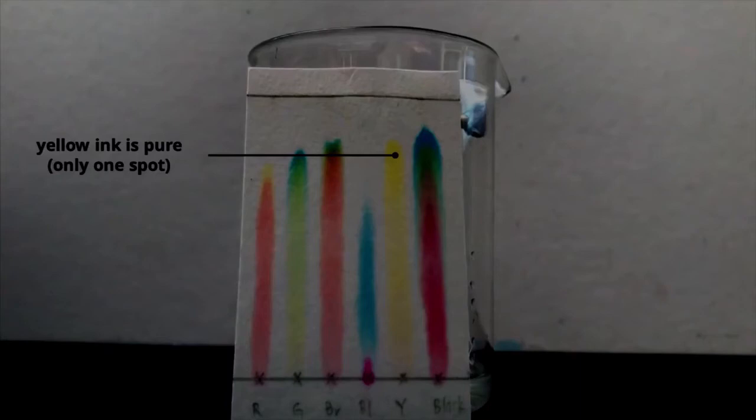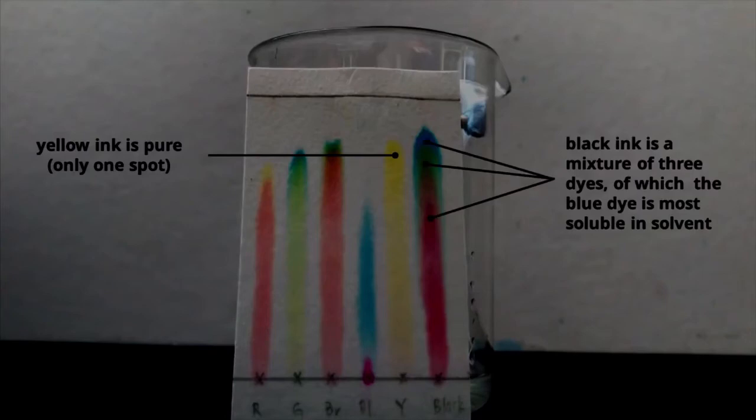Let us now look at the results. We can see that many of the inks are made up of a mixture of dyes, except for the yellow one, because there is only one spot. We can say that the yellow ink is pure as it is only made up of one dye. The black ink is a mixture of three dyes, of which the blue dye is most soluble in solvent as it has traveled the farthest.